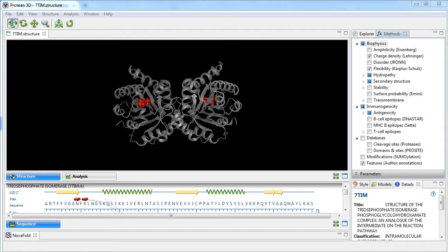DNA Star's Structural Biology Suite is our software package that provides tools for protein sequence analysis, macromolecular visualization, and protein structure prediction.